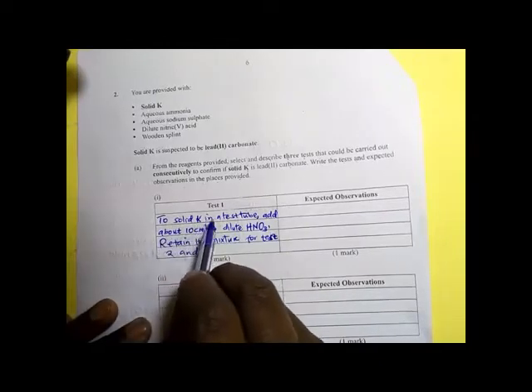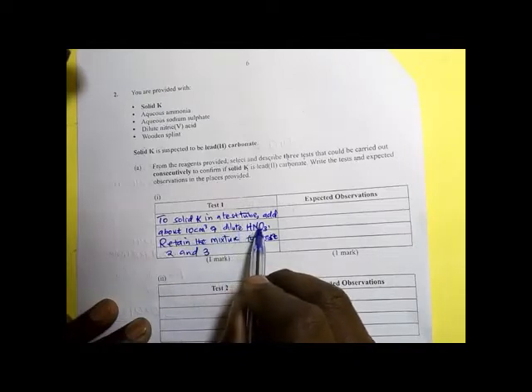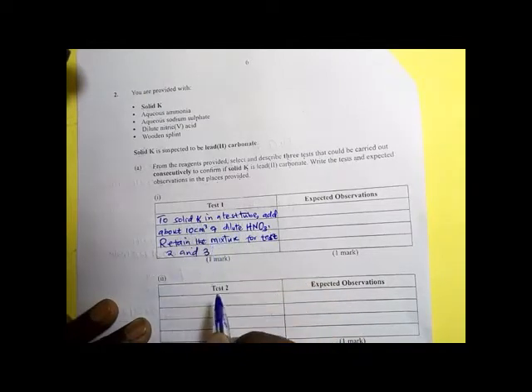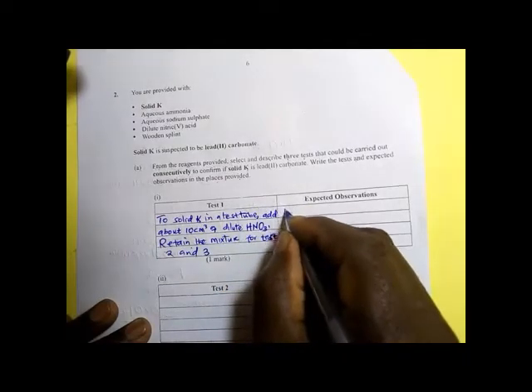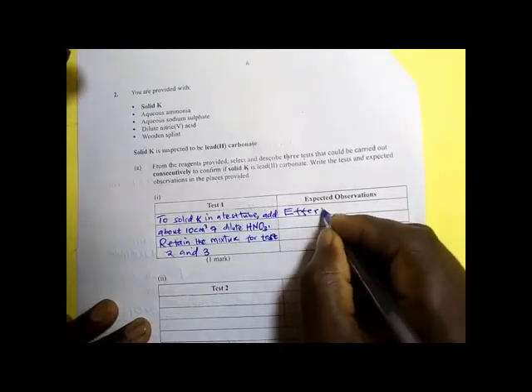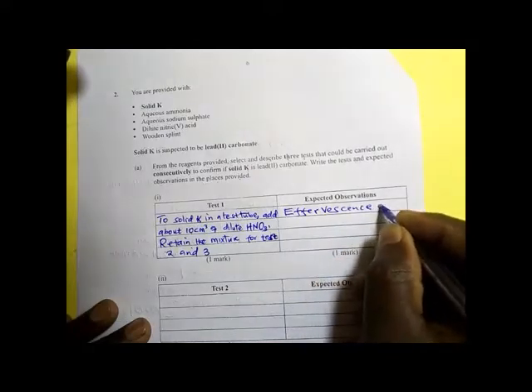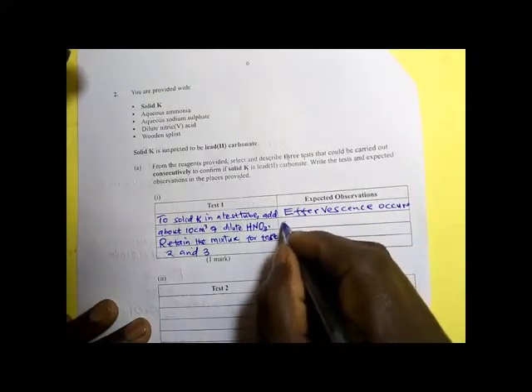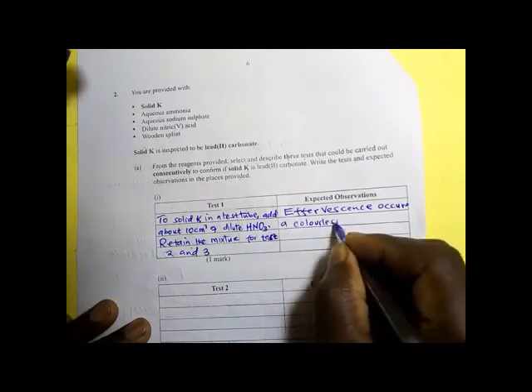So when you added 10 centimeters cube of dilute nitric acid to solid K, what did you see? If indeed it was a carbonate, then you expect what? Effervescence. Effervescence occurs. Another observation is that a colorless gas is produced.